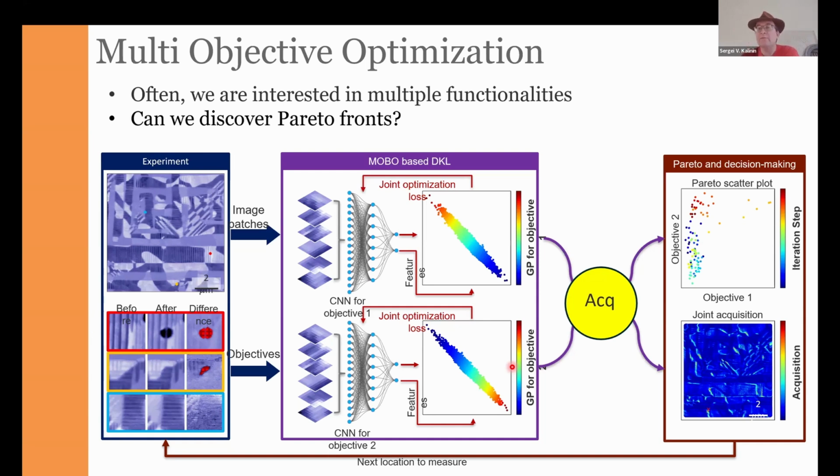Now imagine that we have a material with a complex microstructure. The properties, the capability of the material to switch, will depend on the different locations. So we still can run the experiment where we apply a bias pulse and form the domain like this. But in some cases, the domain would have a nice spherical shape. And in some other cases, it would be elongated.